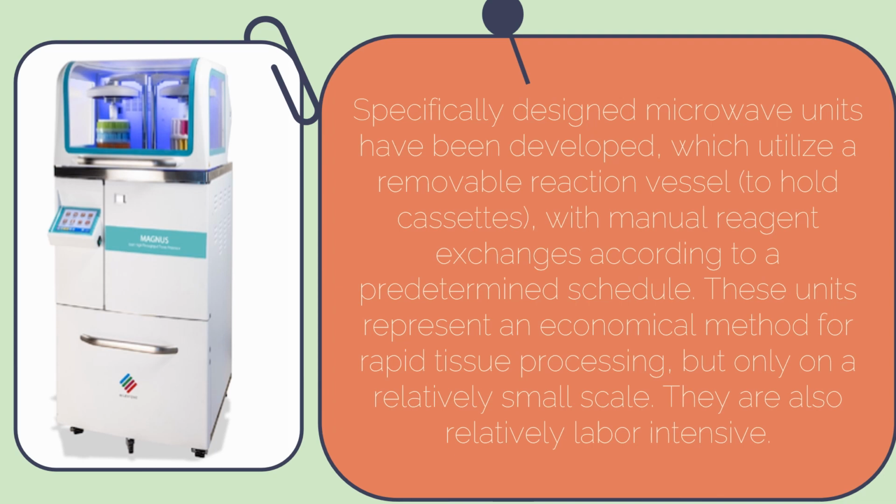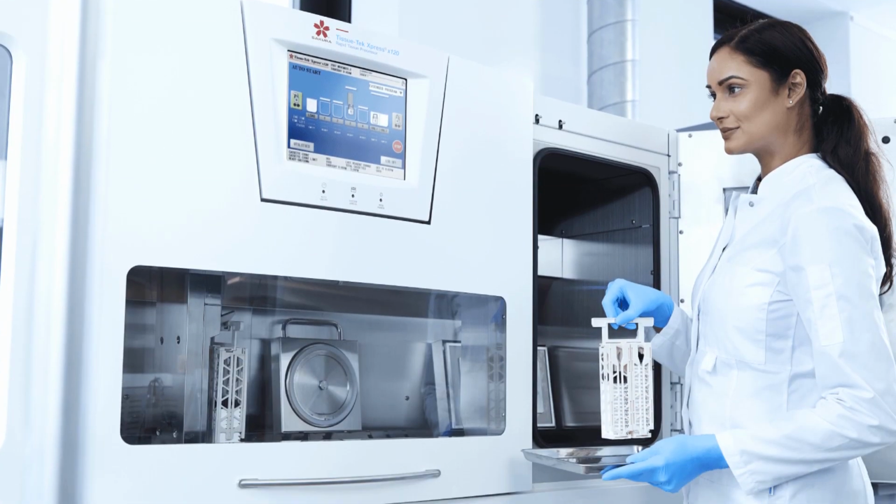We also have specifically designed microwave units that have already been developed, which utilize a removable reaction vessel to hold the cassettes with manual reagent exchanges according to a predetermined schedule. These units represent an economical method for rapid tissue processing, but only on a relatively small scale. They are also relatively labor-intensive. So this is an example.